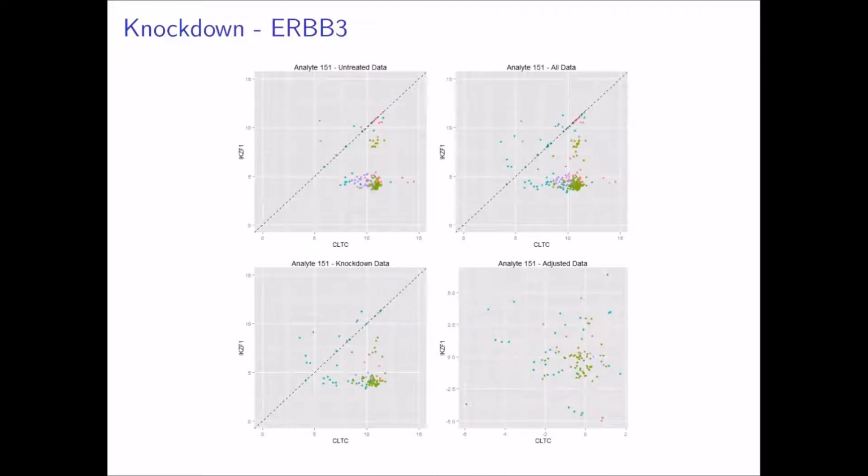This is the example of the pair that did have the clustering shown before, and for example, this green has a large portion here, but this is one of those other clusters that had kind of a mirror up here before, but for this particular data set, they show up here. So here's some clustering before, and if you look at the knockdown data, you still see a few points that show up there, but predominantly they're in the lower cloud.